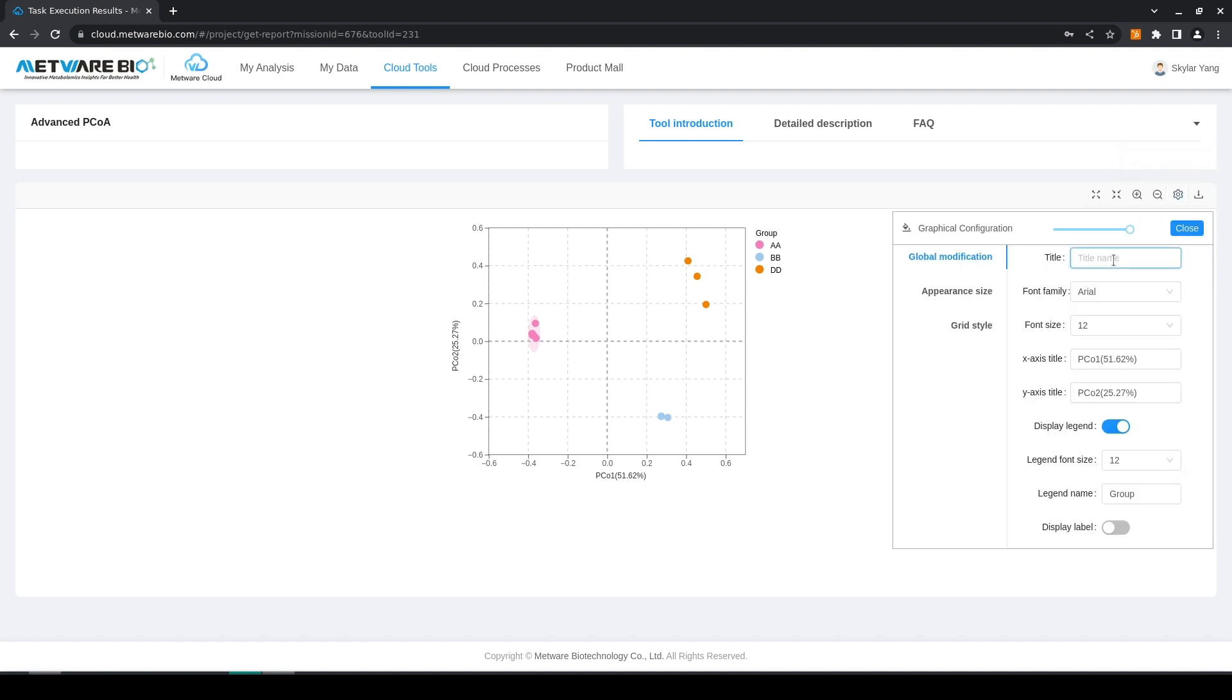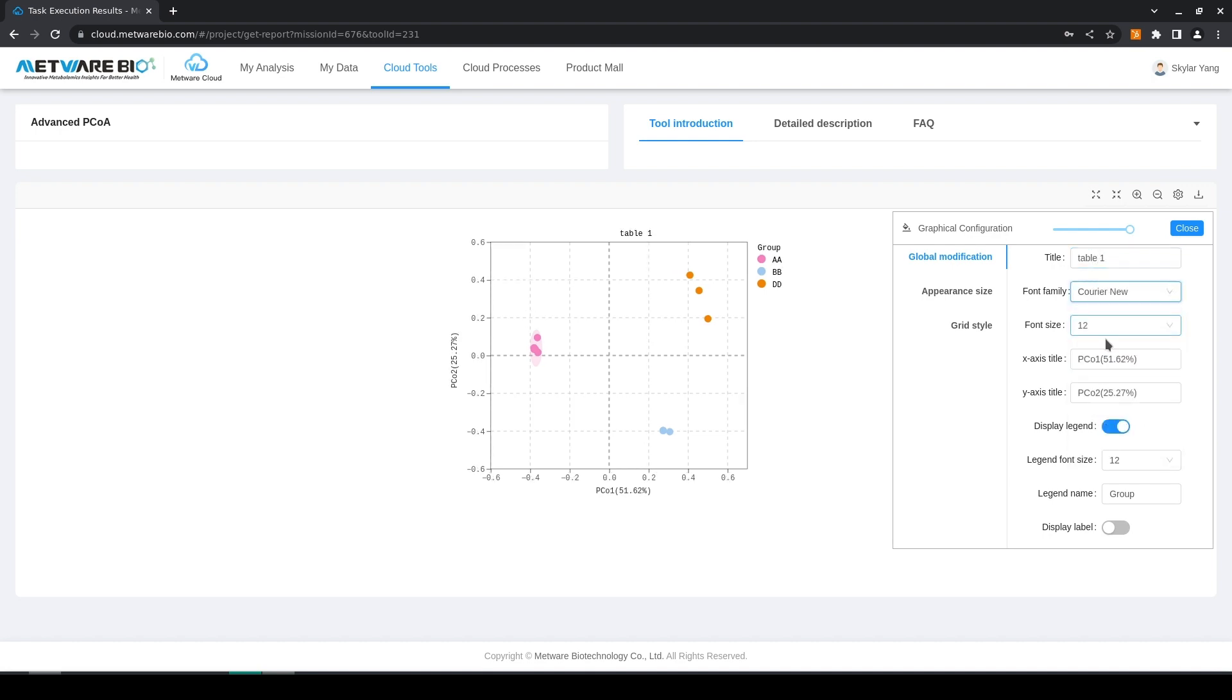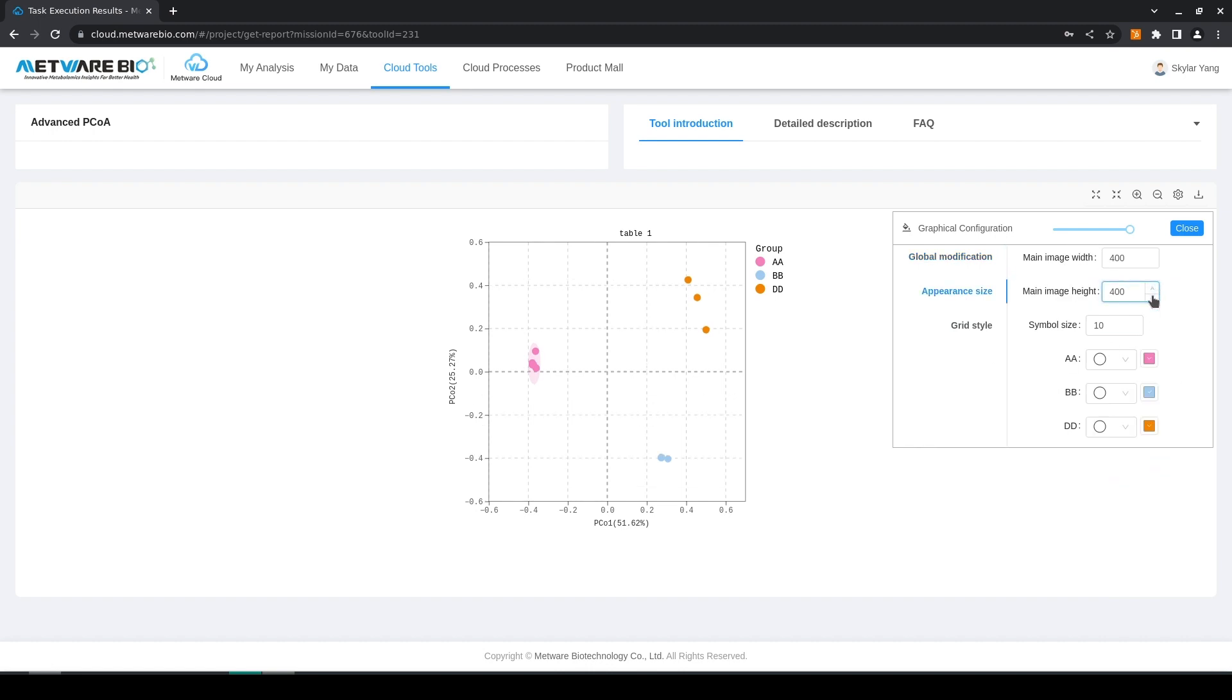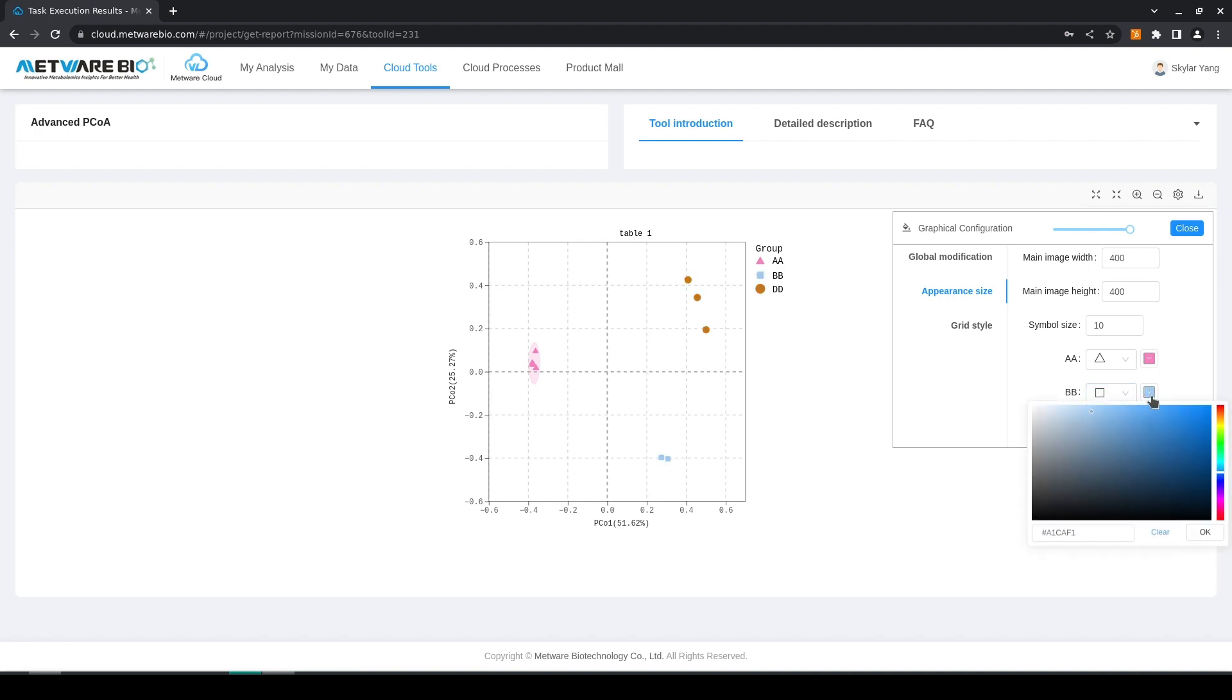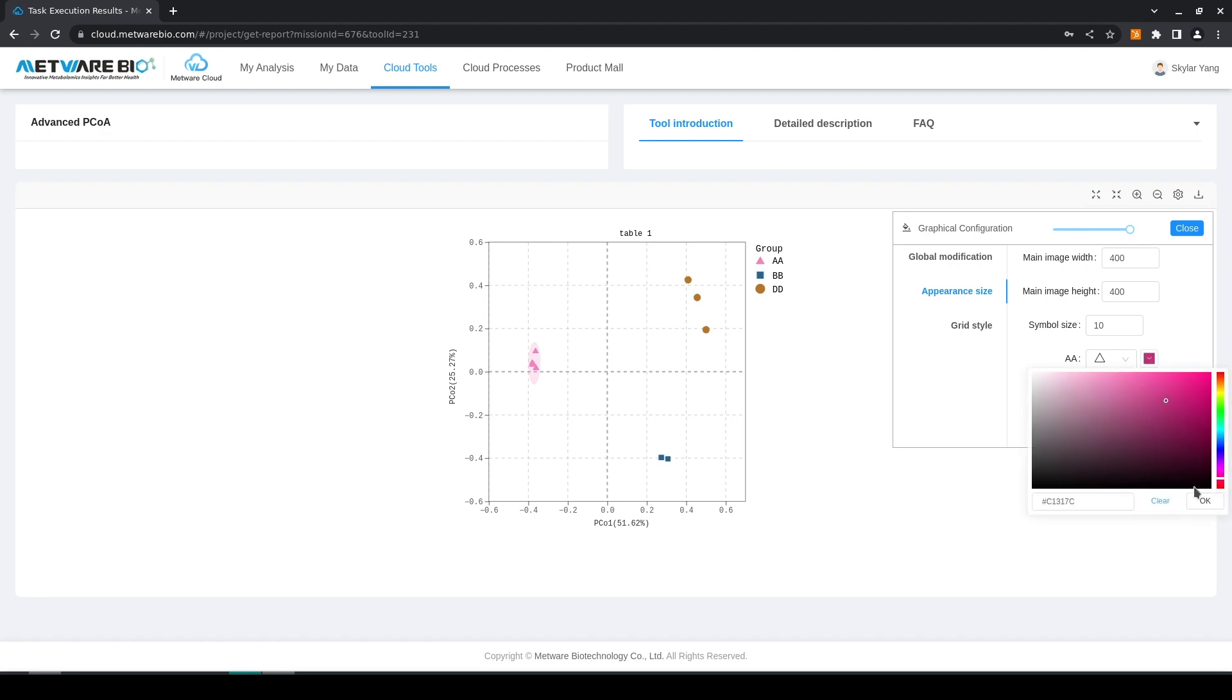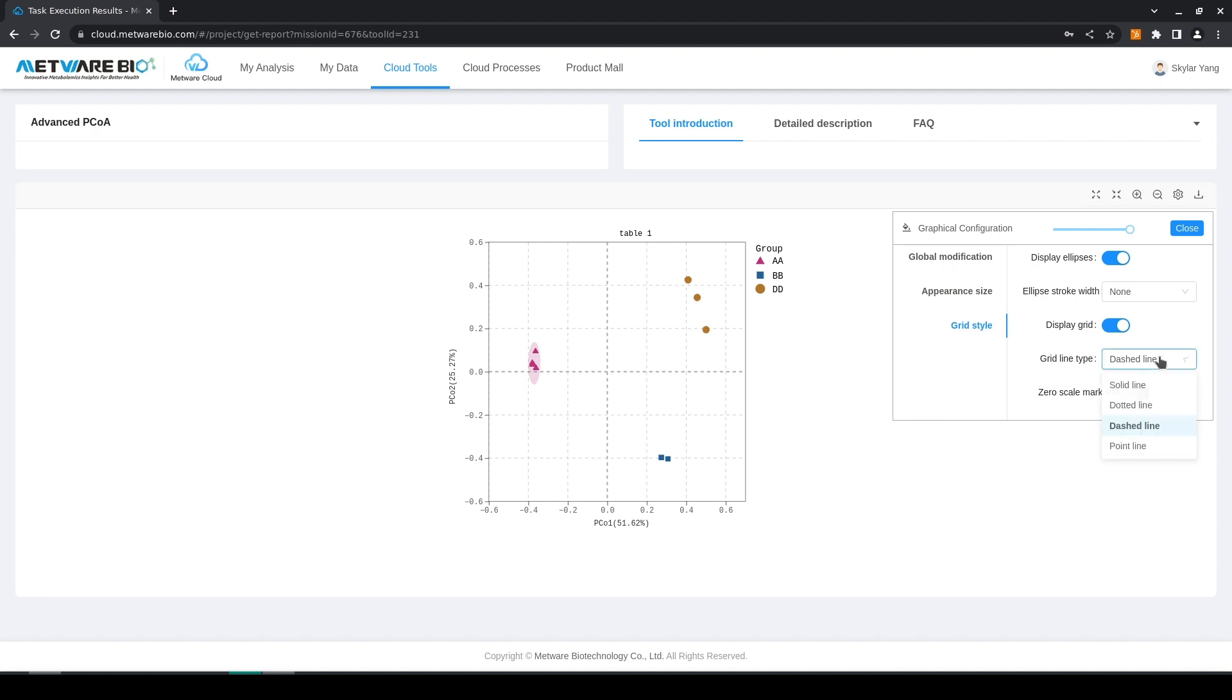We can add a title, we can edit the font, you can edit pretty much everything you want of the graphical output, and add a title color and also grade.